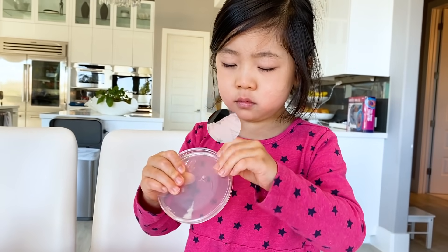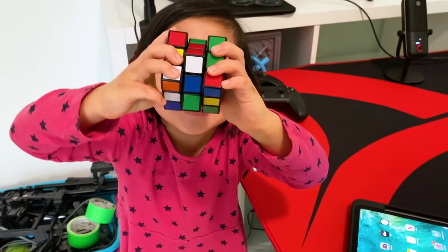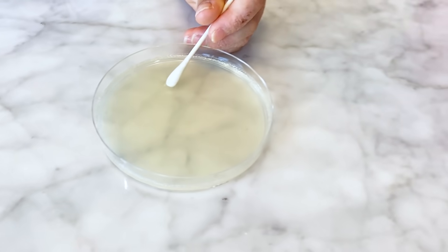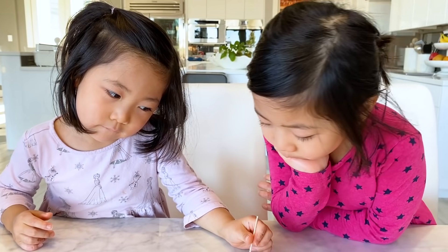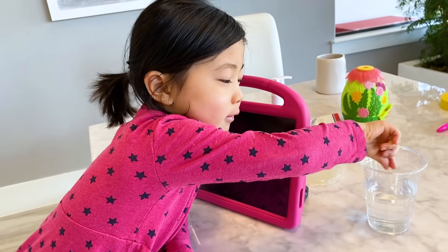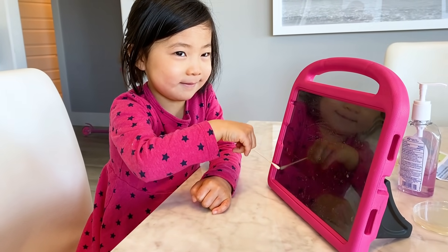And I'm going to do Ryan's iPad. Ryan's iPad? Yeah. Close it and then flip it over. Make sure it's tight. Good job, Emma. Kate found Ryan's iPad — she's going to swab it. Make sure Ryan's iPad is clean. And Emma found a Rubik's Cube — you know how to swab one of those? It's hard. Now Kate is swabbing Ryan's iPad. Kate, do you think there's lots of bacteria on there? Yeah. What do you think, Emma? We're not cleaning it. Really?